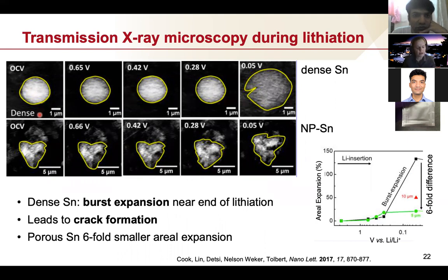We try to go at least C/5, C/10, C/8 is usually what we're trying to aim for. If we're running out of time, we go to C/3, but we want to stay away from really fast cycling, unless that's the point. Got it. Thanks. Yeah, I'd have to remind myself by going back exactly what the C rate was for these cells. I think these were C/5. Yeah, good.